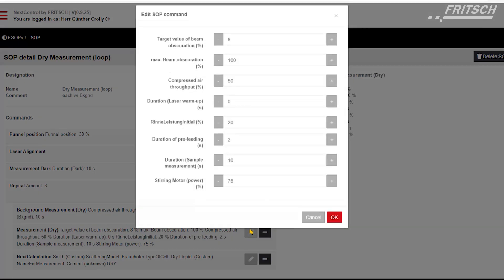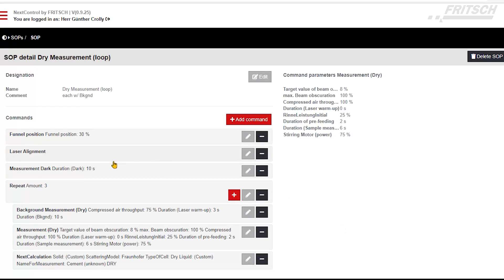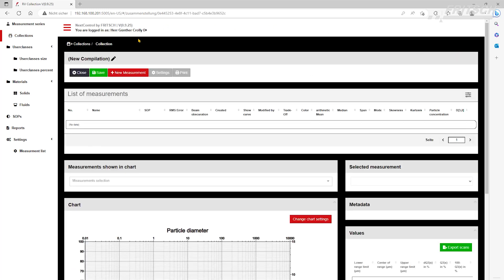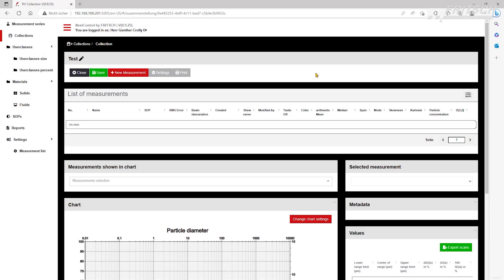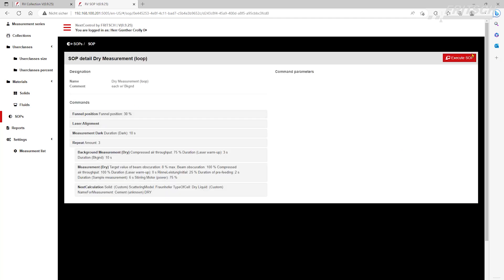We can now adjust settings like the compressed air, the measuring duration, the feeder power, and so on. Once we're satisfied with the settings, we go into the collections and add a new one. We change the name — call it 'test' for example — and then hit the new measurement button. We select our SOP and again have the chance to make any desired changes, which we don't. We just click Execute.